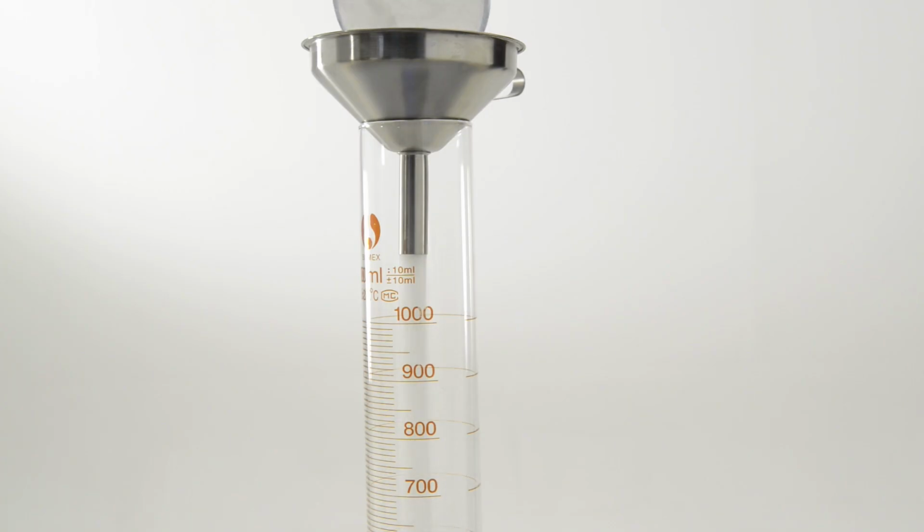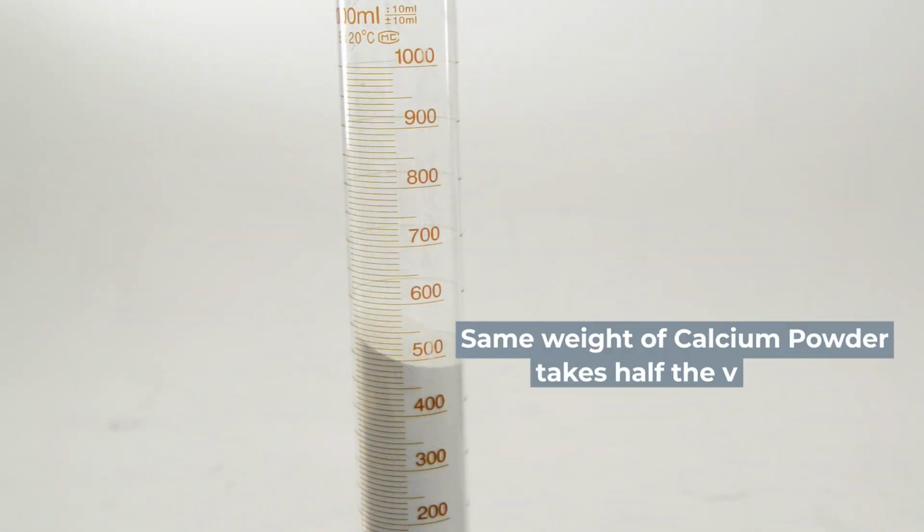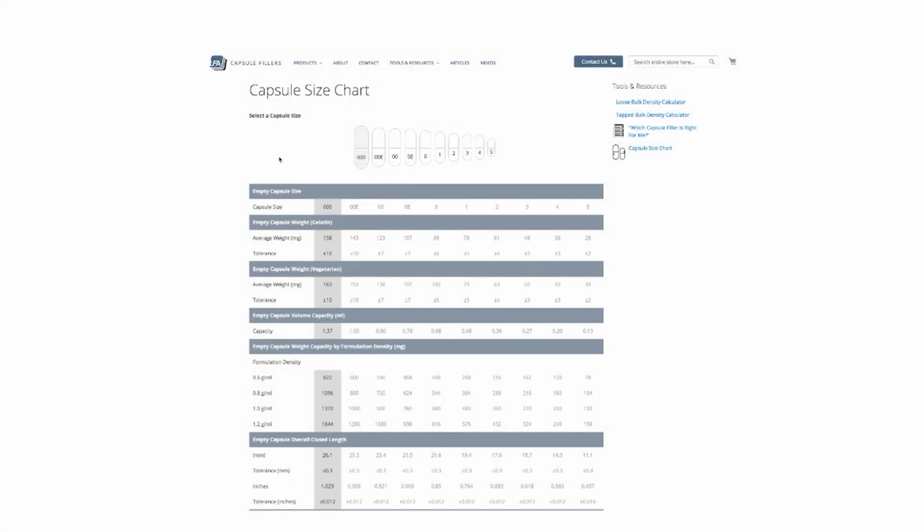If we look at one of our previous videos on bulk density, you'll see that when we fill the cylinder up to the 1 litre mark with magnesium stearate, it weighs 597 grams. We then took calcium powder as an example and weighed 597 grams, and it took up half the volume of the cylinder at 500 millilitres. It showed the major differences in formulation weights.